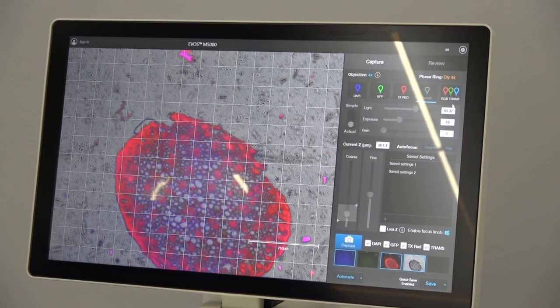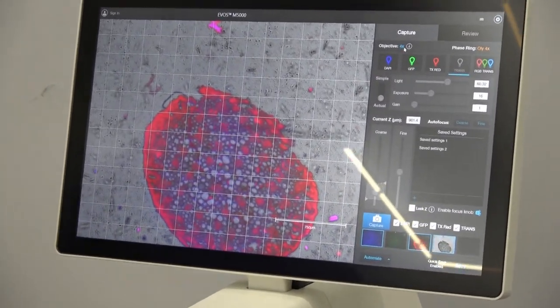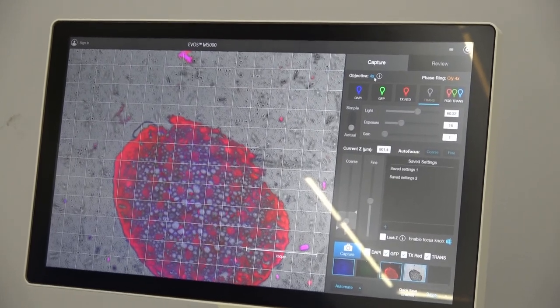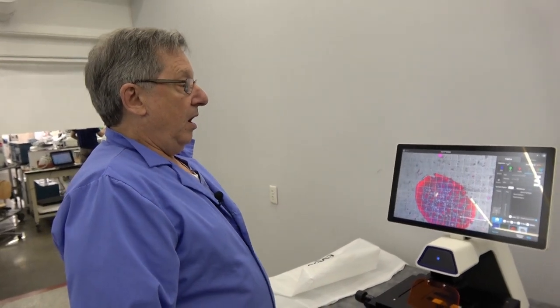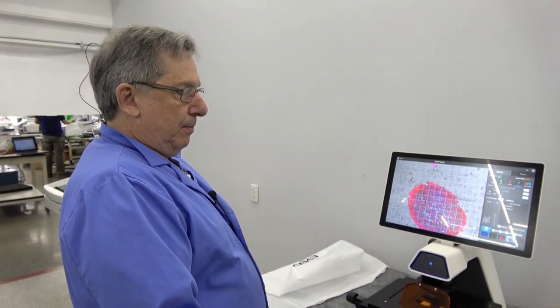It's all on screen. What's your different objectives? This particular model, we have a 4, a 10, a 20, a 40, and a 100 objective. And that's an oil immersed. It's available with different options.